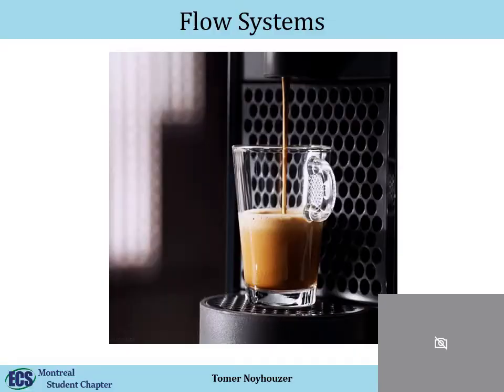Let's start. So this is a basic example of a microfluidic system. You have your pump, which is the driving force which takes water from the reservoir and pushes it towards the chemical cell. The chemical cell in our case is the coffee pod, where the coffee is extracted into the liquid. From there, it moves on into the cup and towards the detector, the person that is actually drinking the coffee and deciding if it's good or bad.